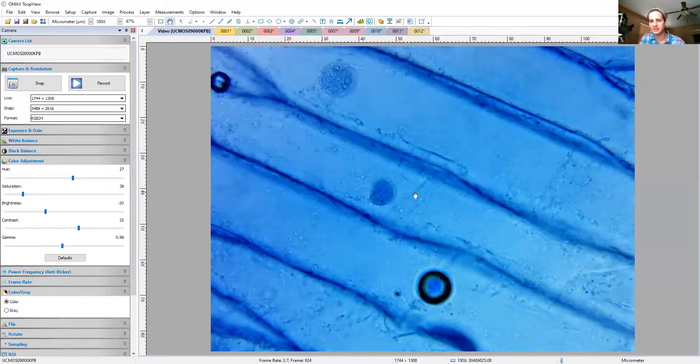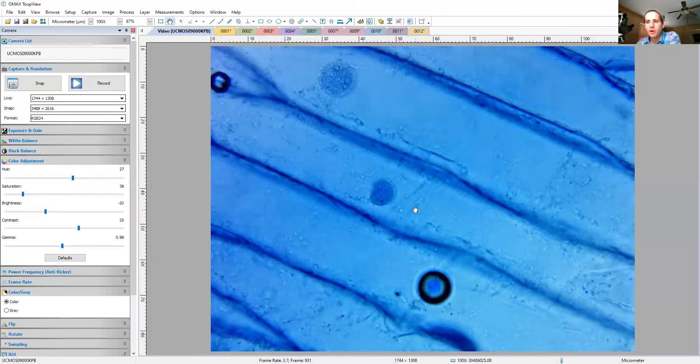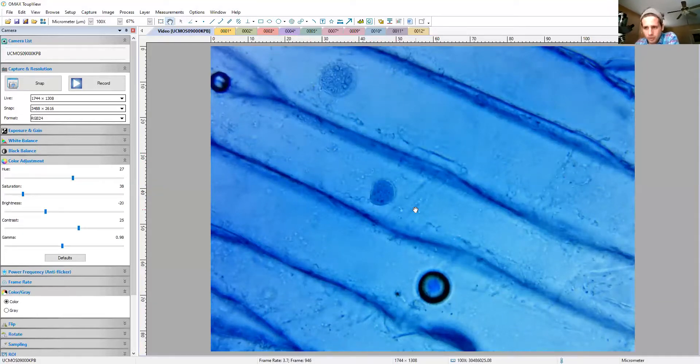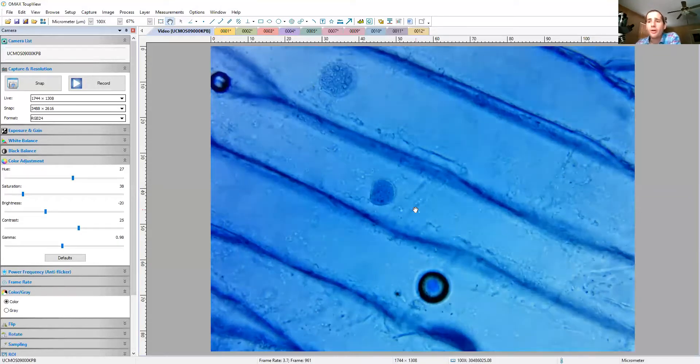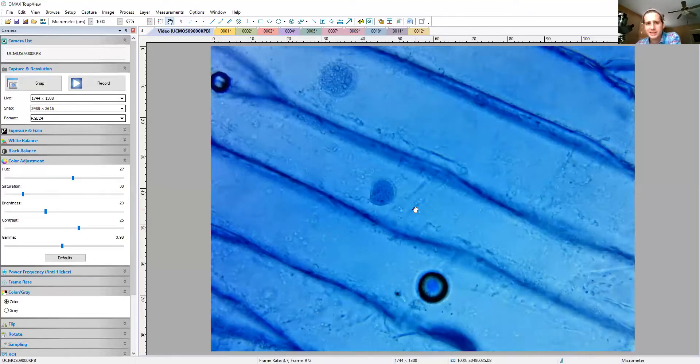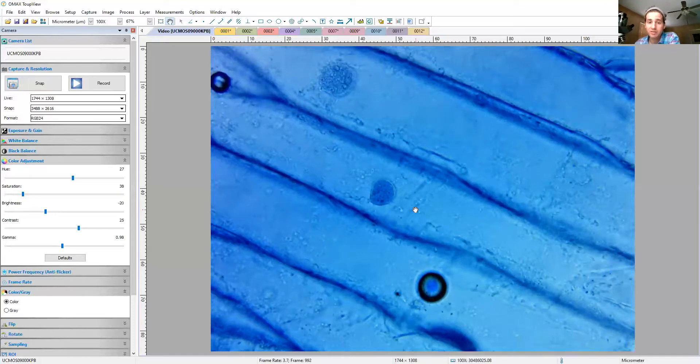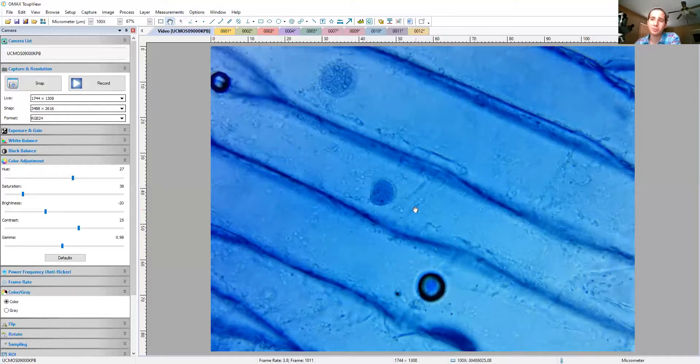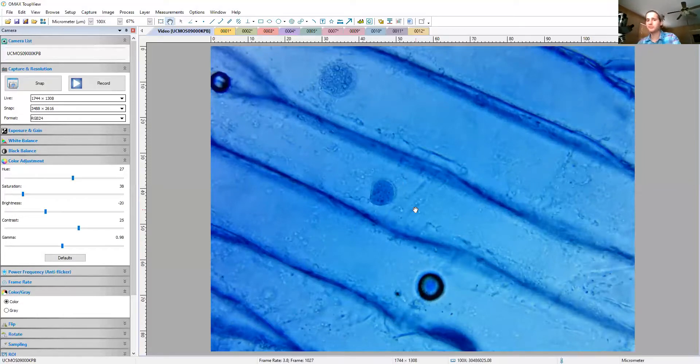So another interesting thing to note here is that you might have heard me mention this is an onion cell. Well, onions are plants, right? Where are the chloroplasts? The thing is, it's not that onion plants don't have chloroplasts, but plants don't have chloroplasts in their roots, just like we don't have solar panels in our basements.